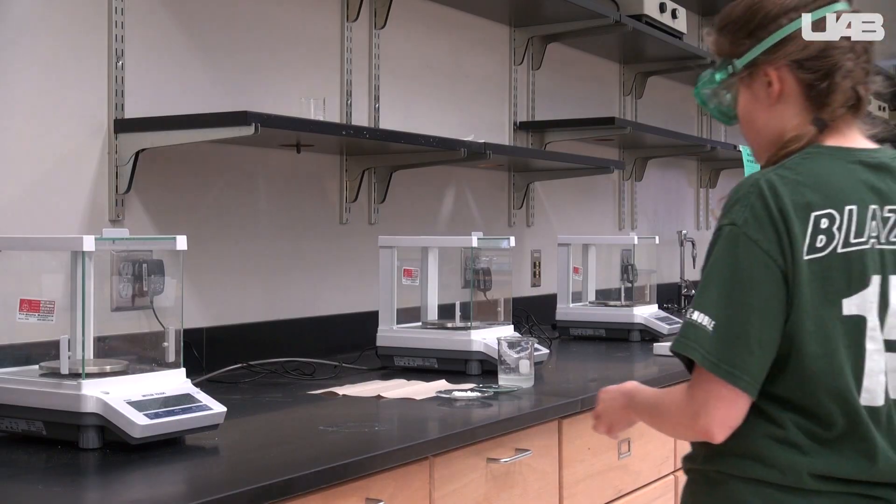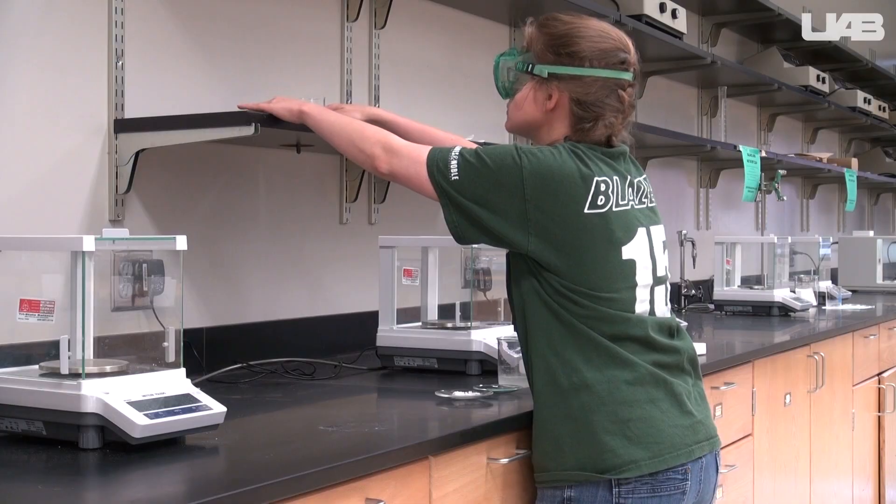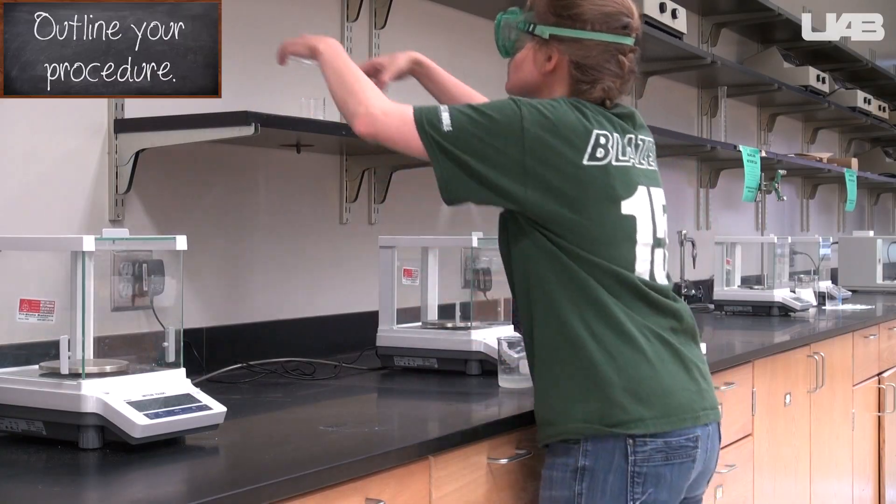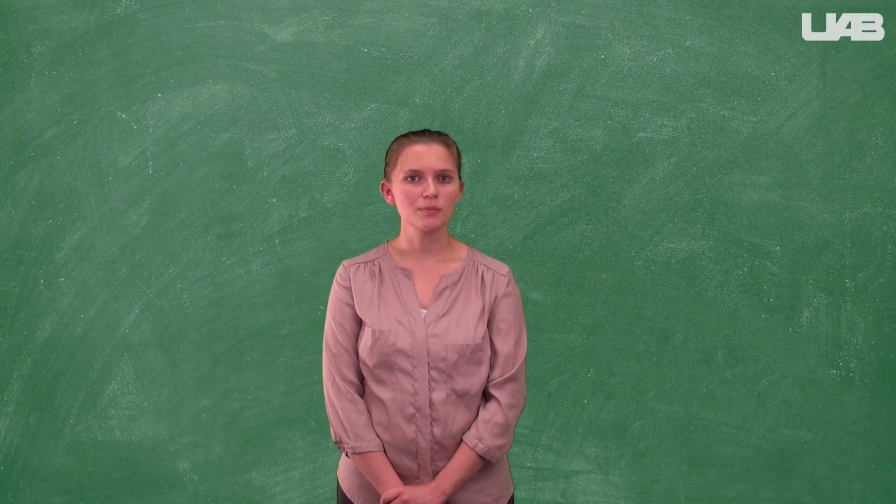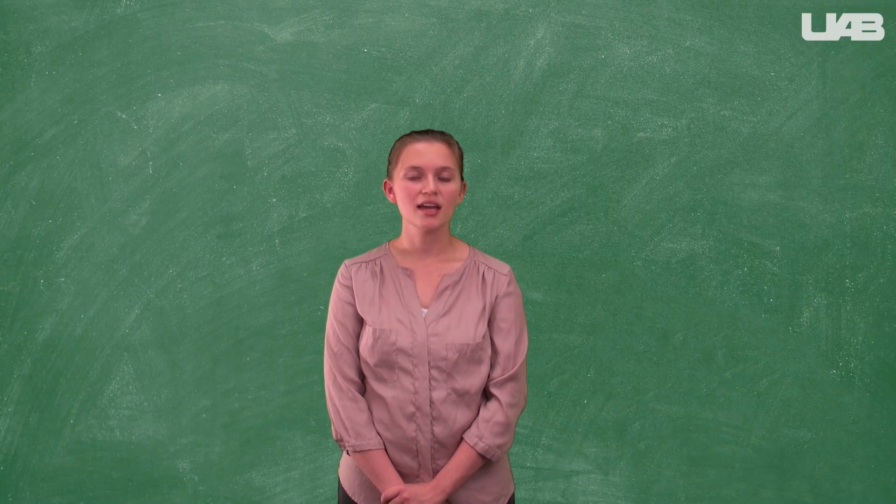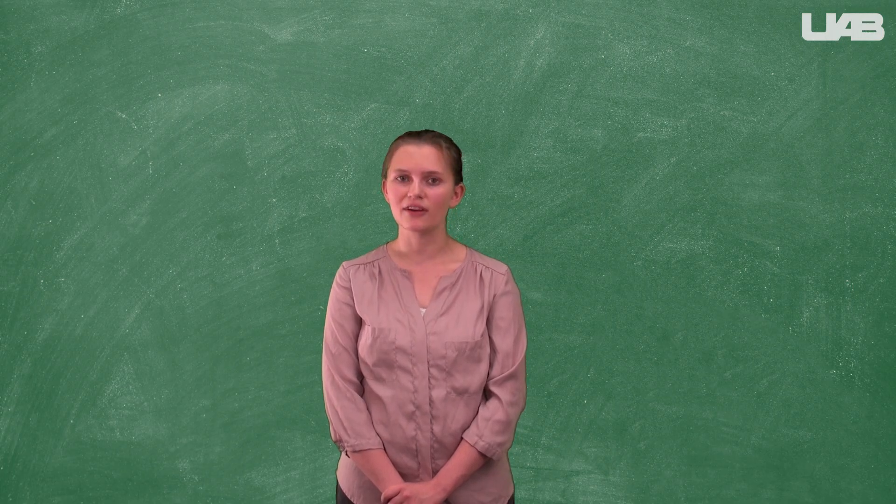Take the watch glass containing the protein, the watch glass with the calcium phosphate, and the beaker with the acetone fat solution and place them on a shelf or in a drawer that your TA assigns to you. You can write on a paper towel to label which is which, and make sure you put your names and the lab section on the paper towel so that you can find them next week.